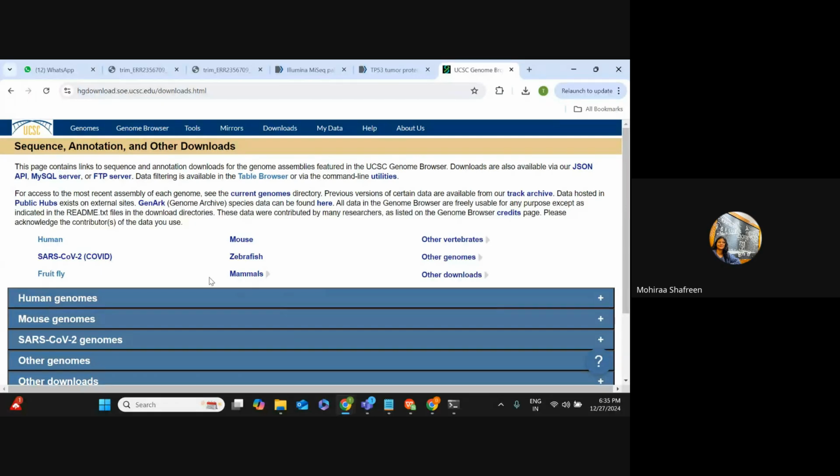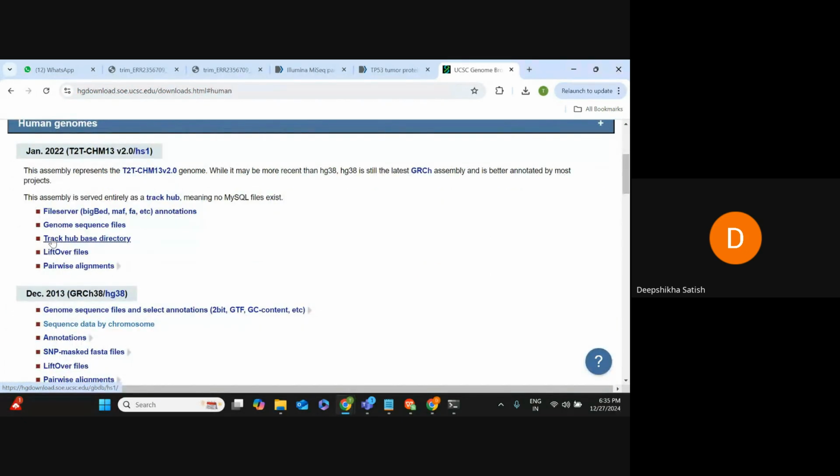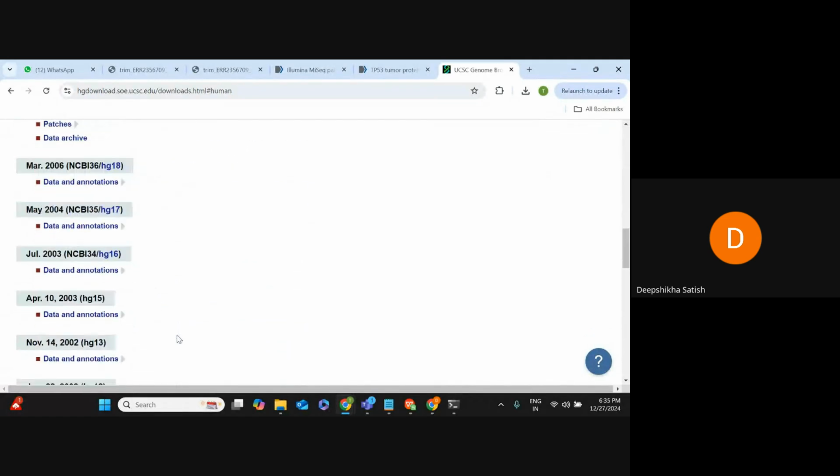Yes, ma'am. Now, what should we do? Okay, so now there are a lot of other organisms also, but we are interested in the human, so we are going to select human here. Now you can see there are a lot of assemblies for human. Can you see?